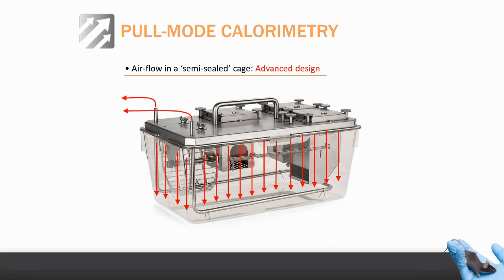And we use a very high flow rate, about 5 times higher than conventional systems. And we're able to do that because we have gas analyzers that have the resolution to pick up the delta O2s, delta CO2s, even though the flow rate is very high.